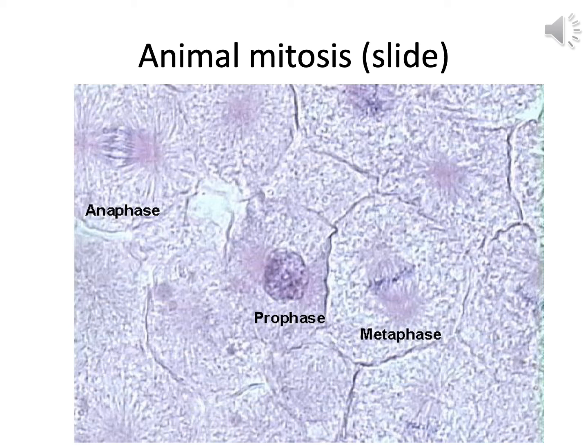On the upper left-hand corner is a nice anaphase. The chromosomes are pulling apart. No, there's not a heck of a lot of space between the two sets of chromosomes, but there is a little bit more space between those chromosomes than there's no space on that metaphase one. So anaphase is pulling apart.